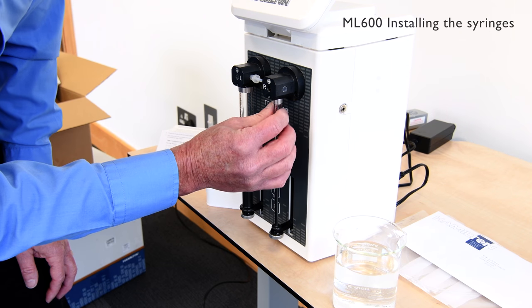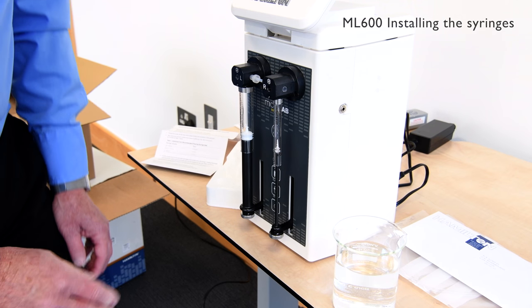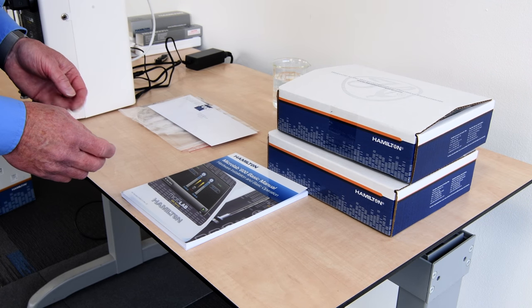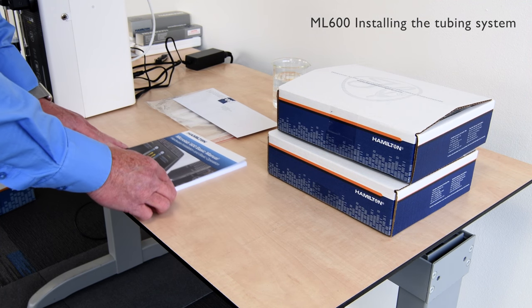Now we're going to assemble the component parts for the Concord hand probe and the tubing line.